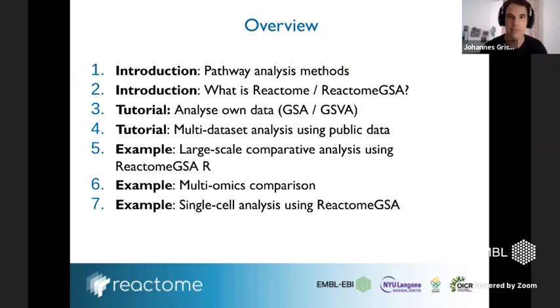These 3 examples are the same that we had last year because they give you a very broad overview of what you can do with our tools. But I will be going over them rather quickly, rather briefly. So if you have questions, either watch the video from last year or just send us an email.